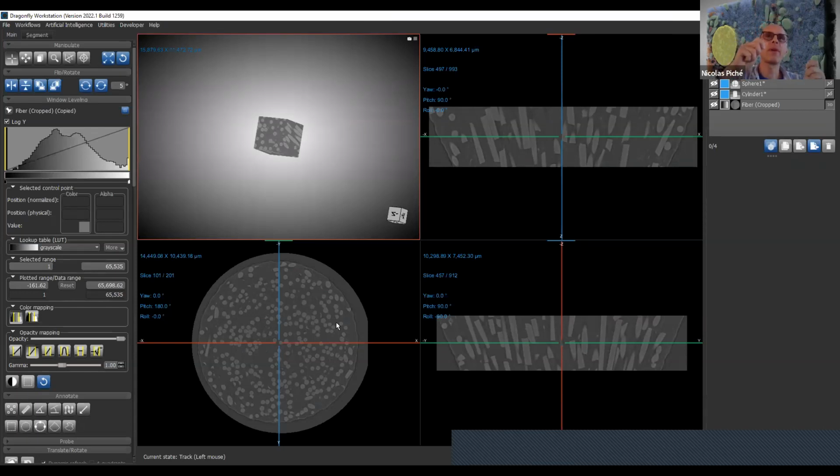The best way to edit a complex path is to work in a curved planar reformat, where you have like a Venetian blind around your path and you move it in that space. This is the way people in medical do centerline, vessel and branching and all that.